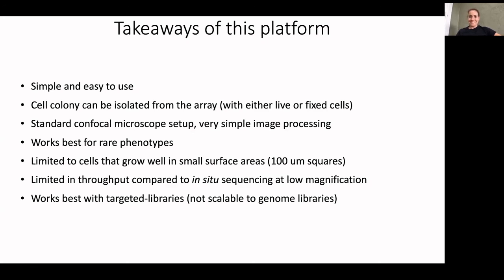Okay, so to be clear, in this setup, you were actually picking the single rafts by hand. You were not helped by any robot. Correct. Yeah. So we did it by hand, and in the case if you have fixed arrays, it's pretty easy to just put them in the fridge and keep picking whenever you want. You don't have to do it all at once. So we were able to pick like 100 in the course of, I think, maybe 2 days. But if you were to pick over more time frame from that, or if you get yourself a little undergrad army, then you can pick as many as you want.